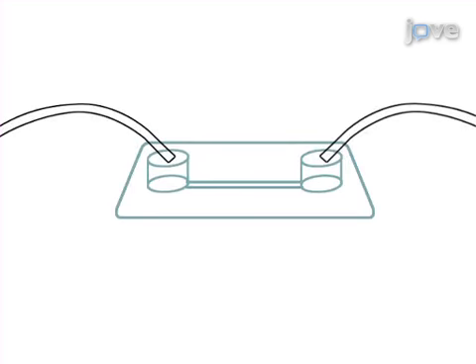The final step is to perfuse the anti-PSMA labeled prostate cancer cells over the E-selectin expressing HUVECs. Ultimately, video microscopy is used to show the interactions between prostate cancer cells and the endothelial cells.